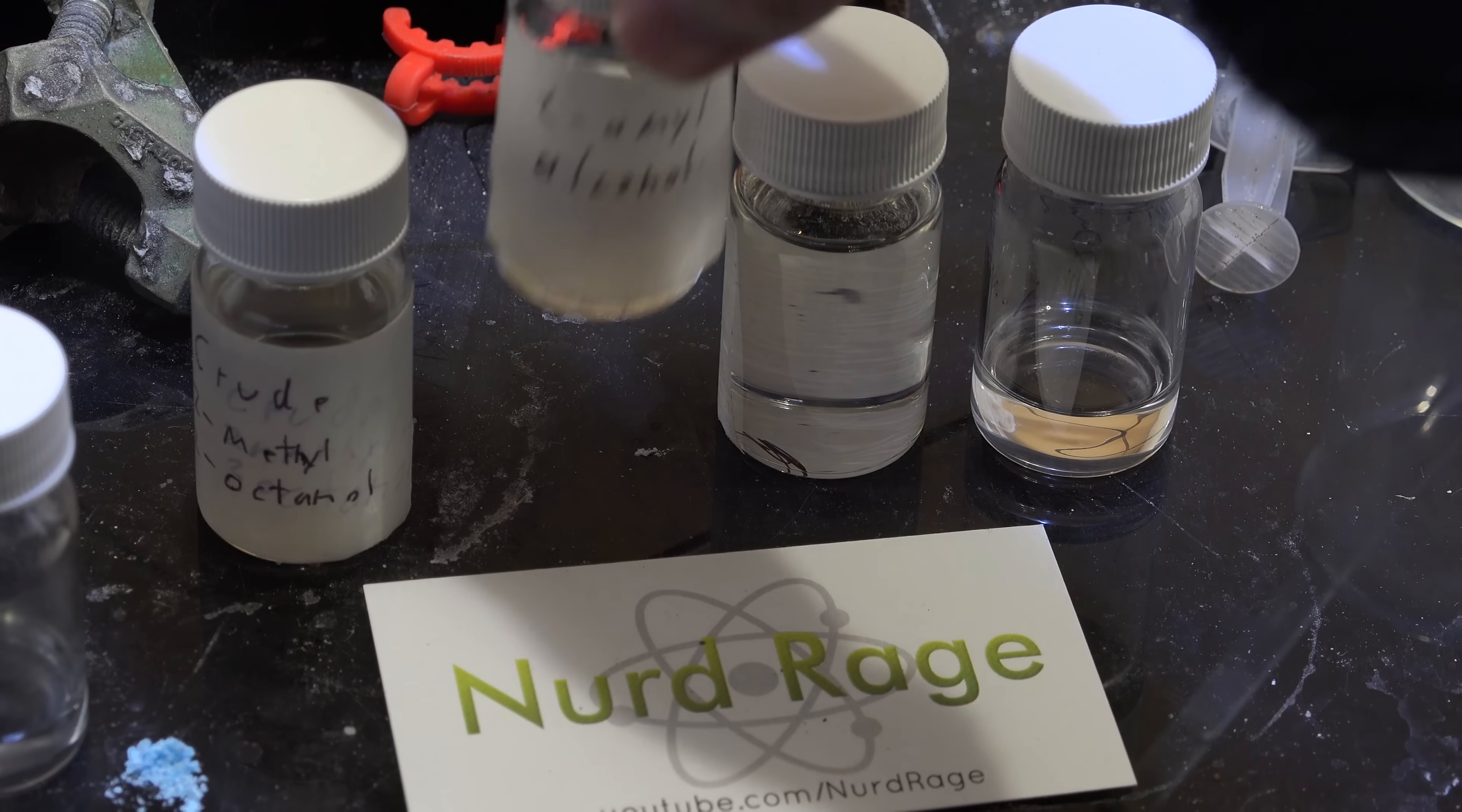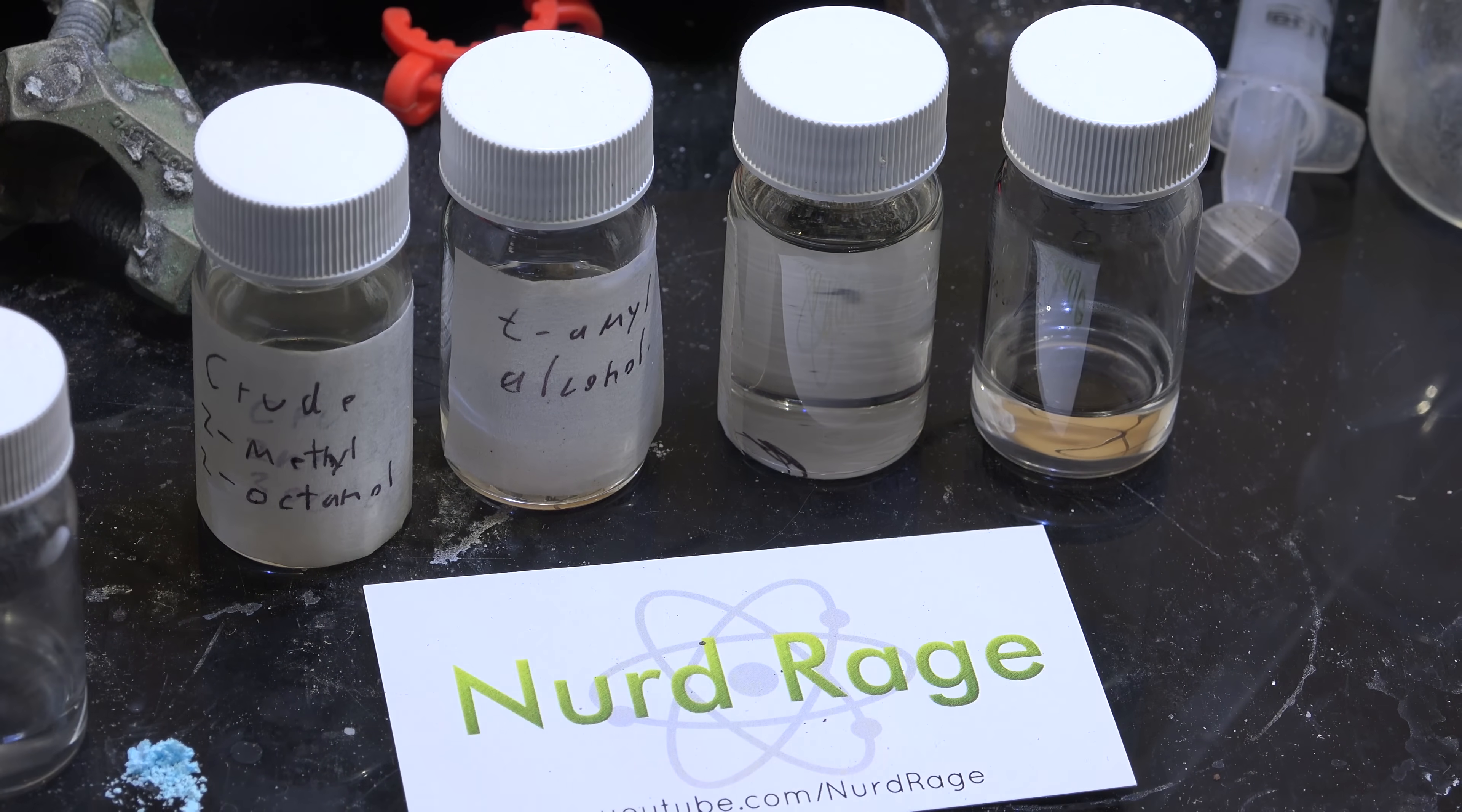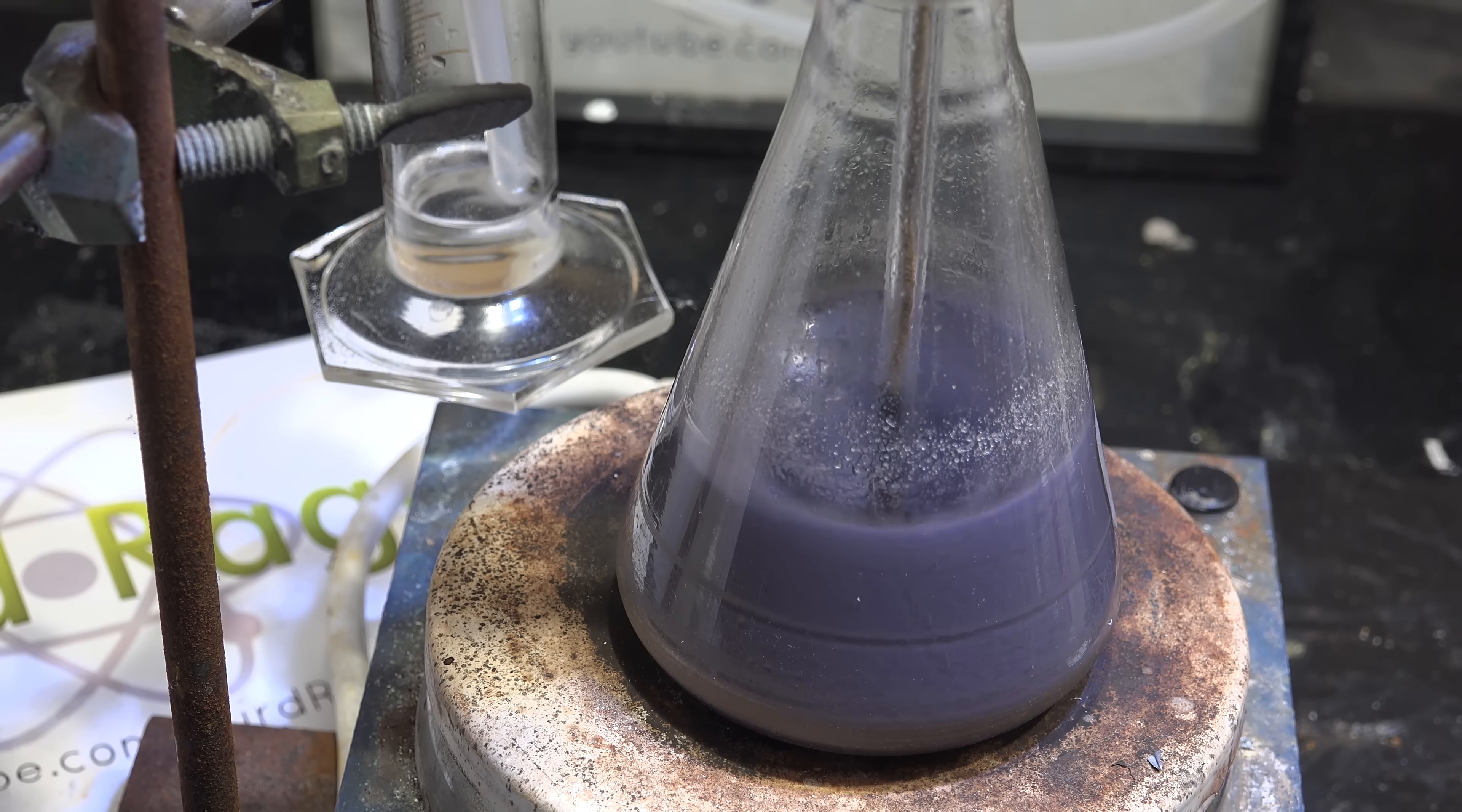They're not available from domestic sources, so if you want to buy them directly you need to special order them online. To make the sodium production reaction truly amateur friendly, we need to find an alcohol we can use directly or at least much easier to make than the Grignard reaction. The first thing I did wasn't to find an alternative alcohol but to test if we even need an alcohol.